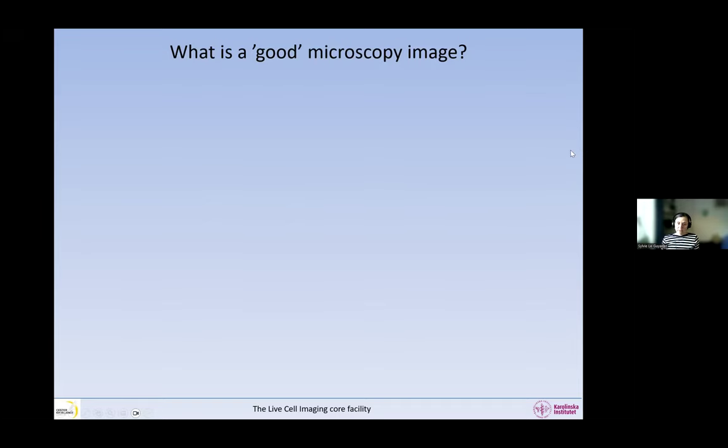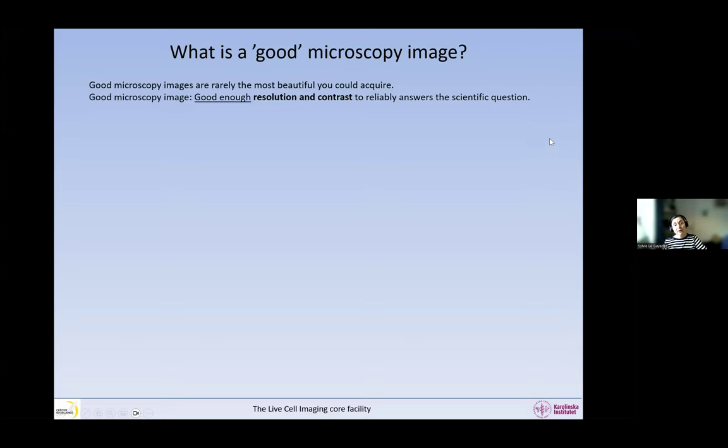So what is a good microscopy image? Good microscopy images are rarely the most beautiful you acquire, and that's okay. If you want to acquire an image because you're going to publish it in a journal, you can set it in a way where it's beautiful. But most images that we're going to acquire are not beautiful, because what we want is data. And very often acquiring beautiful images gets in the way of acquiring data. So we have to separate things. Do not go after beautiful images.